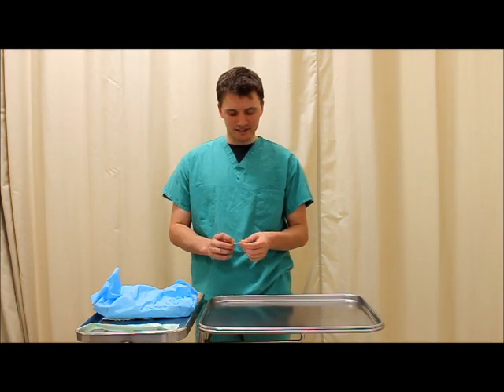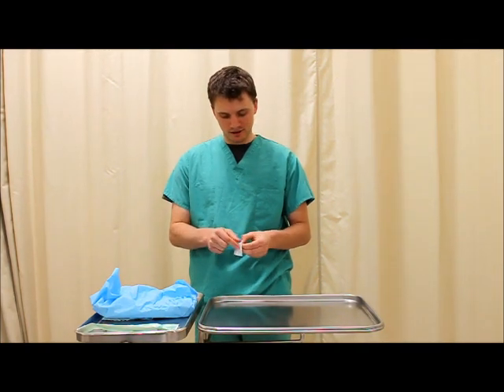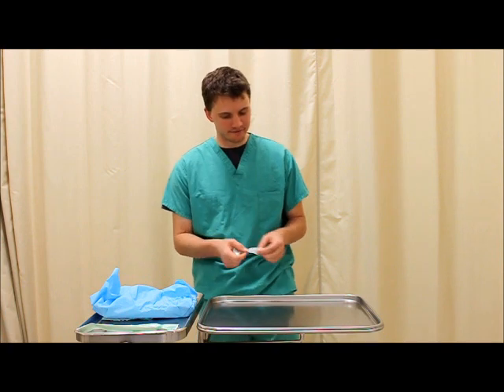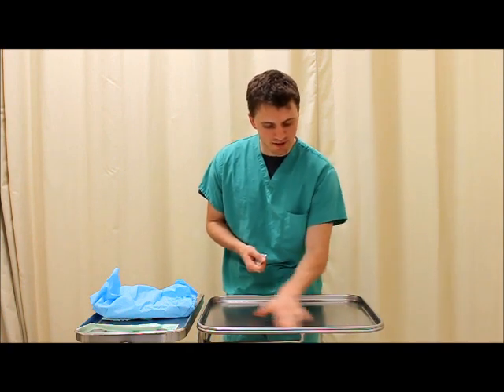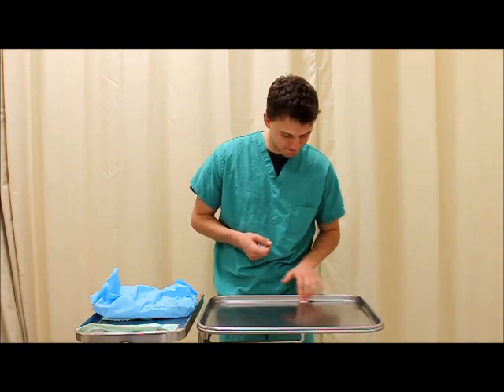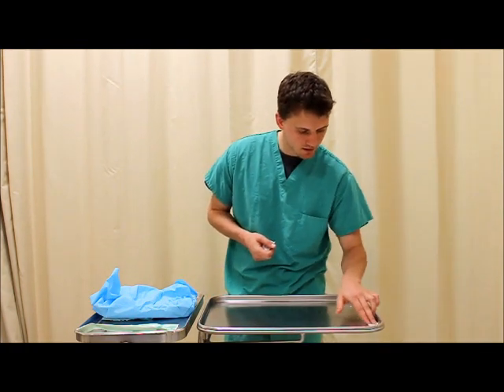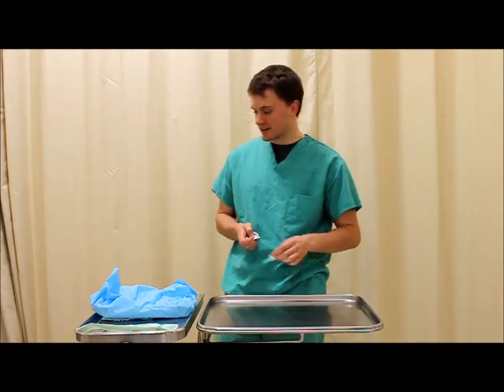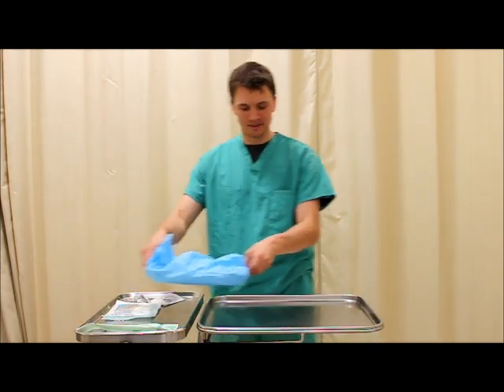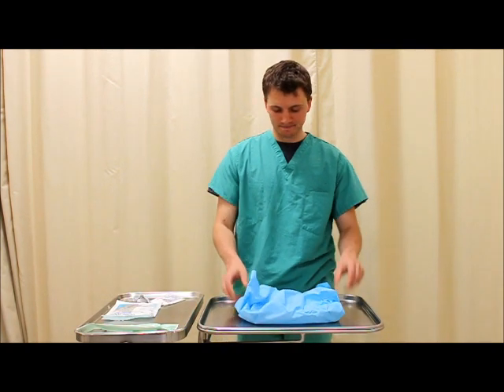So today I'll be setting up a sterile tray. And the first step is to sanitize the tray itself. And I'm using an alcohol swab to do so, making little circles and covering the entire tray. And once the entire tray has been covered, let it dry, and then we can move to the next step, which is getting the tools ready.